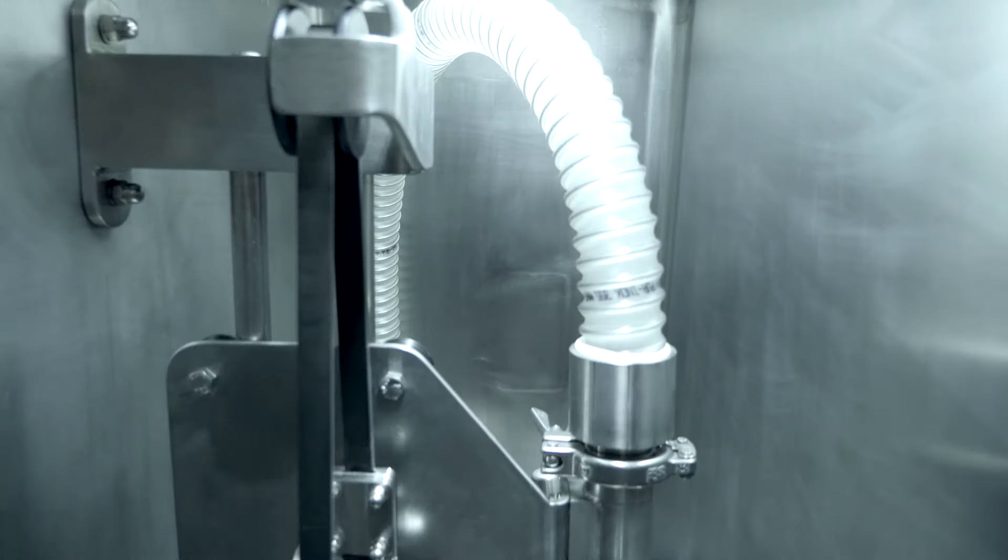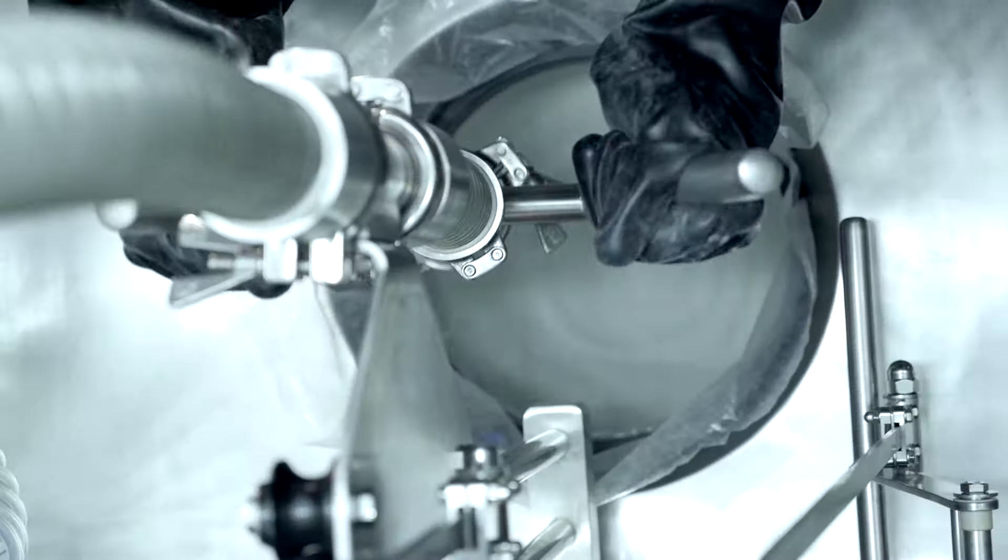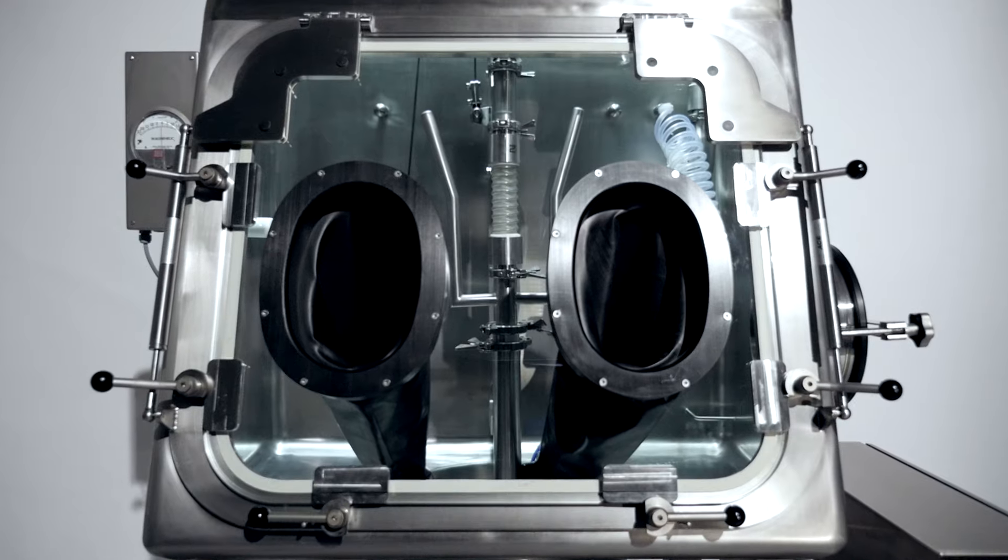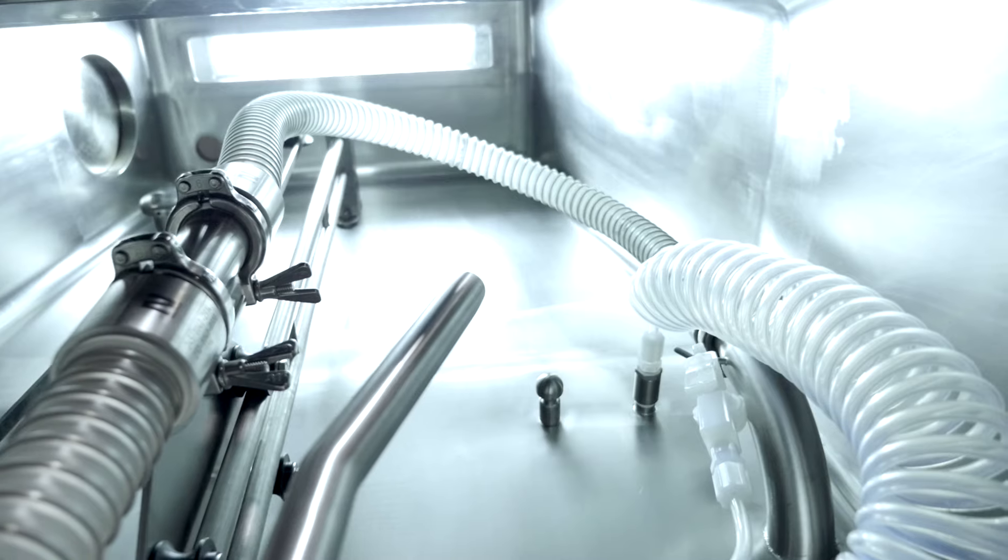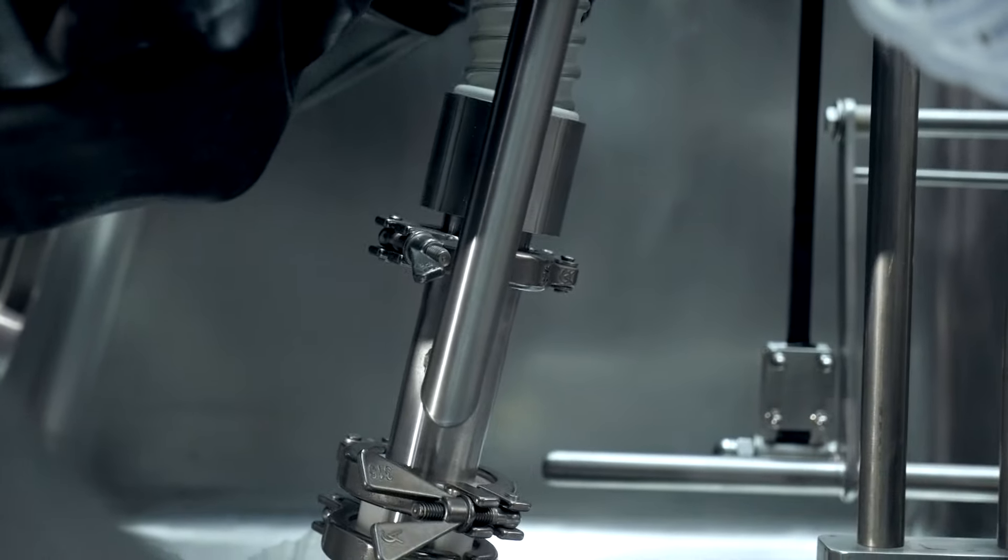The elaborated linear guidance balances the weight and enables the operator a simple and ergonomic handling. The large front sight glass and the powerful LED light on the upper side of the isolator guarantee an optimal control and handling of the system.